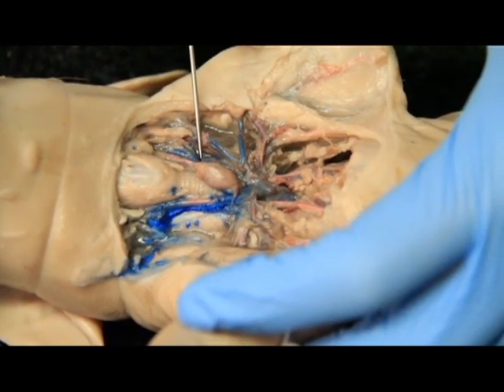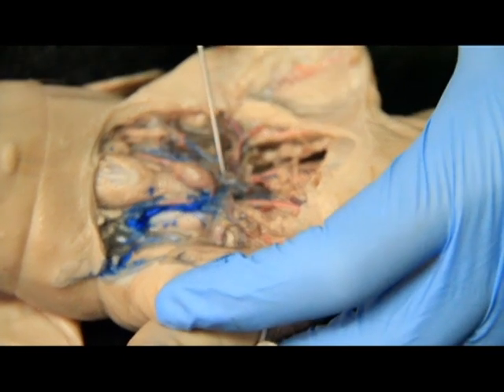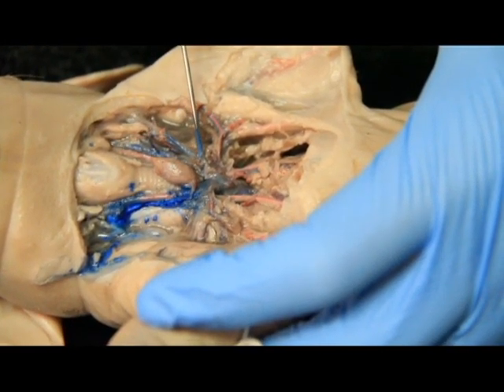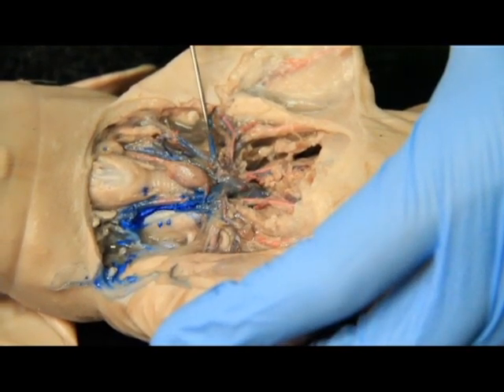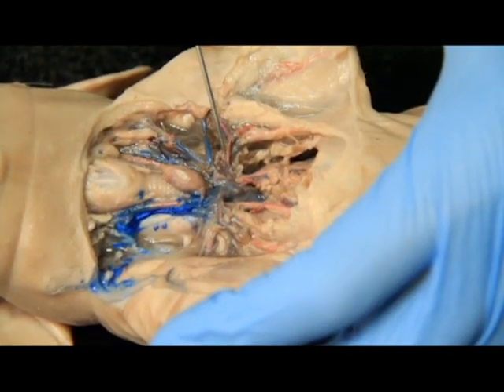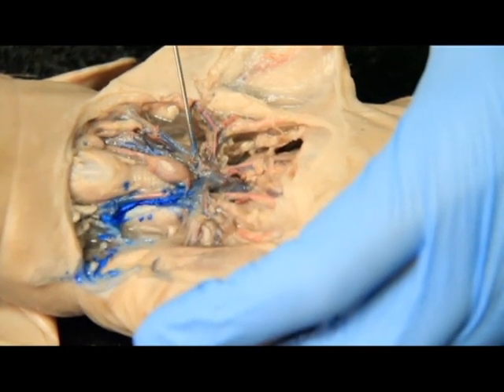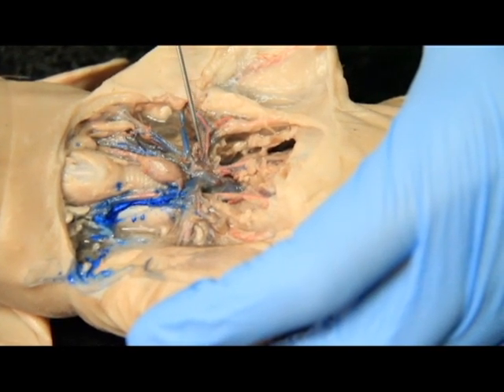So again, we've got one jugular vein, and you can see it follows down here. This is that brachiocephalic trunk, that central area. And then here's the cephalic. So you can see the first branch after the jugular, that's going to be your cephalic right there. Goes all the way across, it's almost about to break. Which again, is very, very hard to do. Now this one, it's actually, the veins are hiding under this artery right here, but you can see the general shape. So again, we've got 1 jugular, 2 cephalic, 3 is your subclavian from here to here.